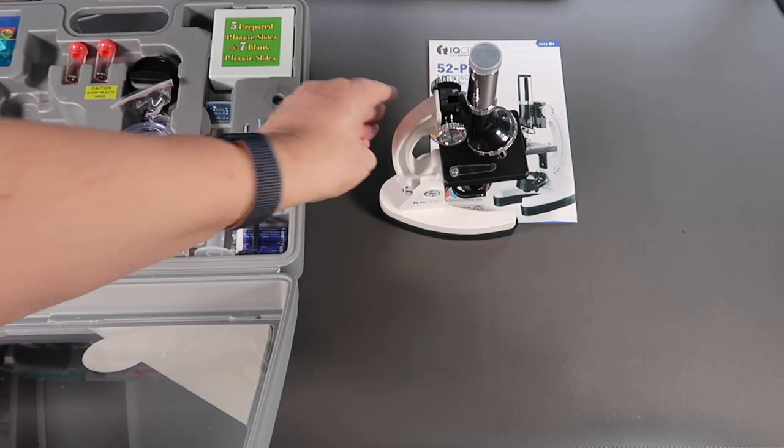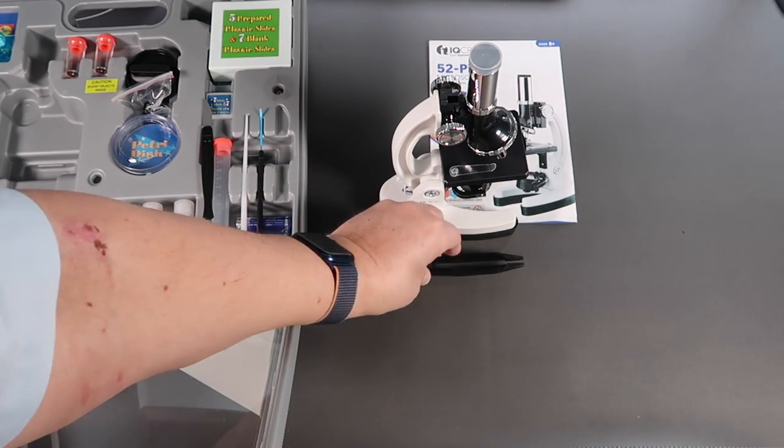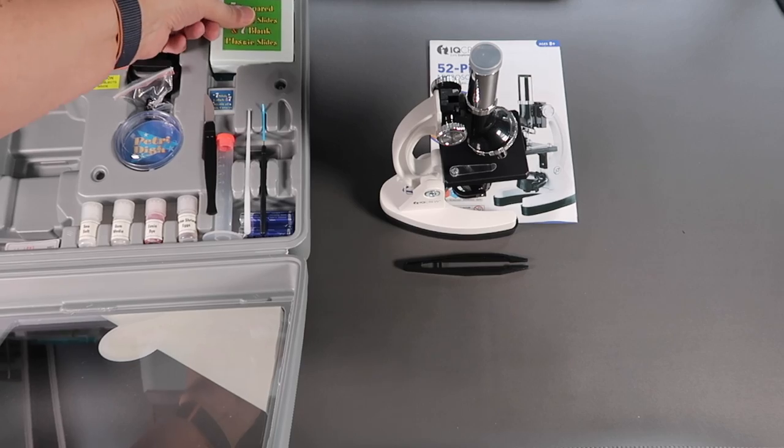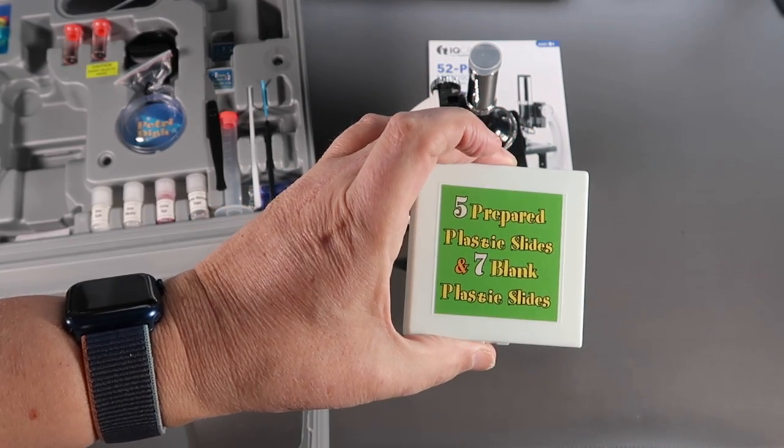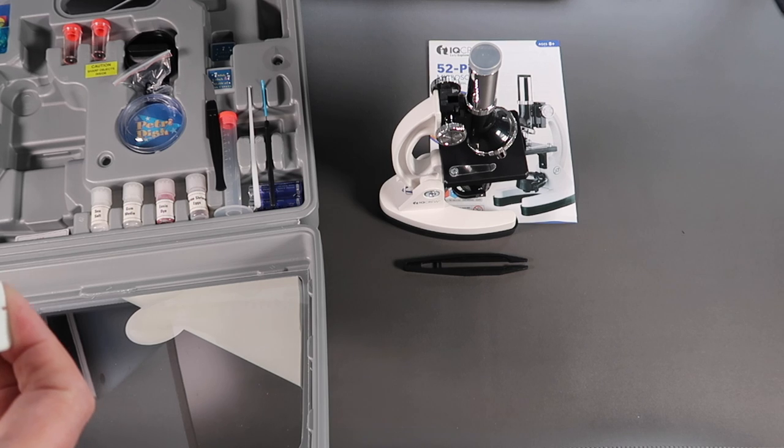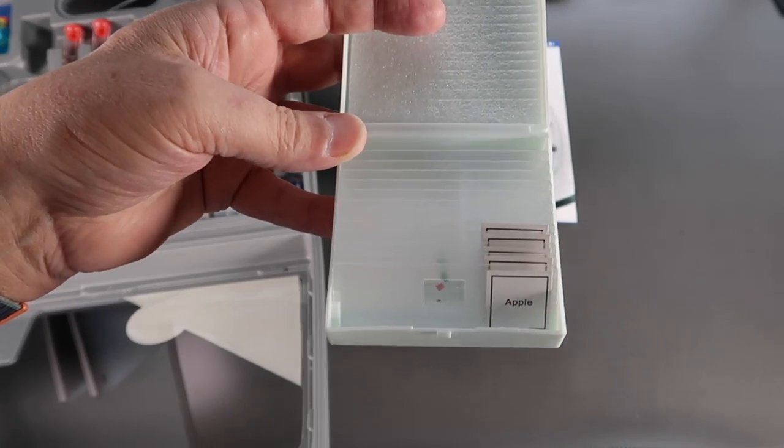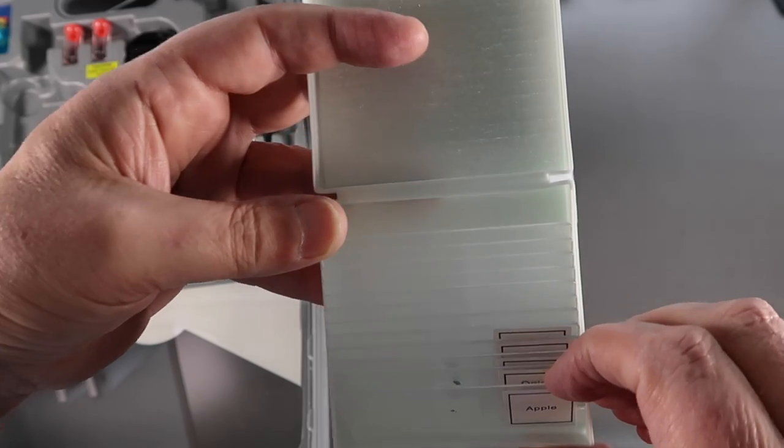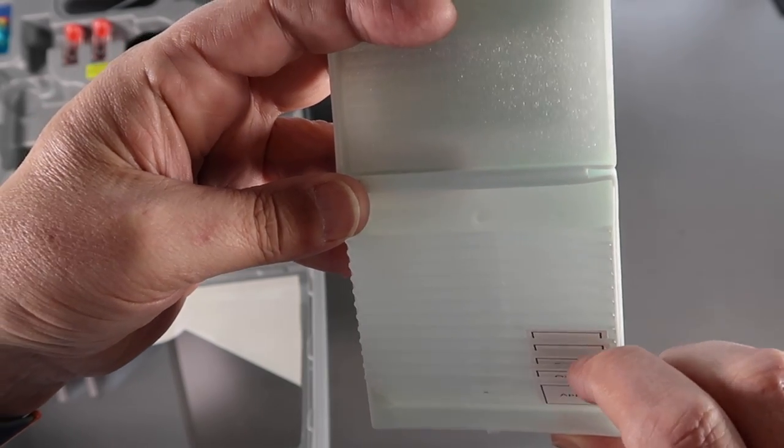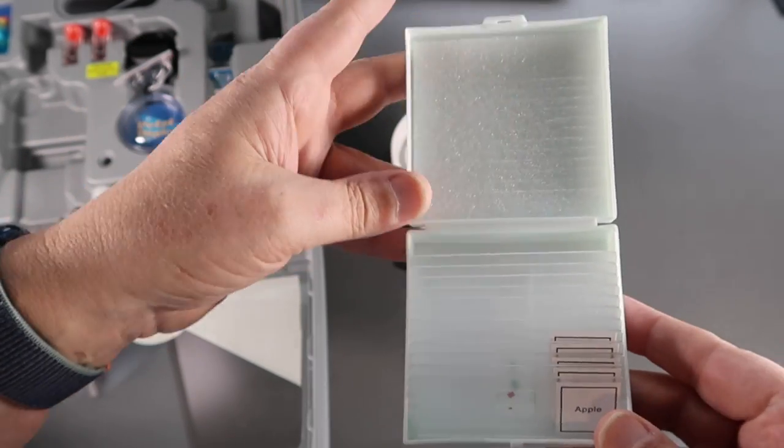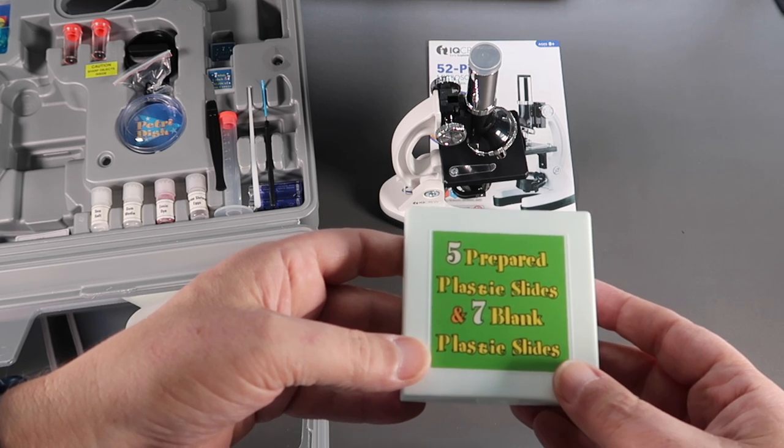So microscope, tweezers, a box of plastic slides. These are actually pre-prepared with samples on there. I see an apple, an onion, broad beans. So that's very interesting. They actually give you some samples to look at. Yeah, five prepared slides and seven blank slides.